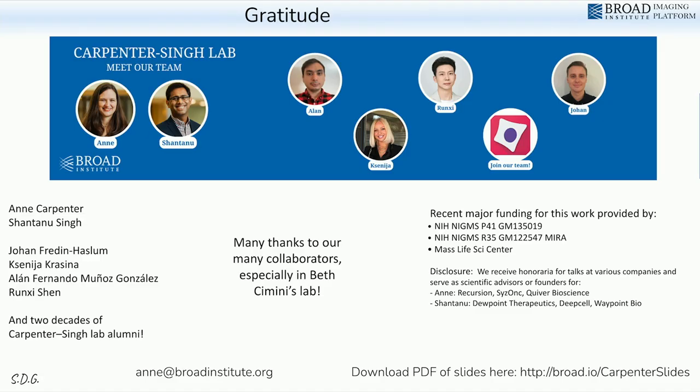Maybe I'm on the side of the audience who are working on more like, we have a biological question and we are trying to apply cell painting, and then we go to present in our department and the cell biologist in the room always raises a hand: okay, you've painted, you get these features, so what? Sometimes I struggle with that answer right off the bat because I can start wobbling around. Well, it's a manifold. We have many features. It's more complex than you think. But how do we make sense? What are the steps to make biologically meaningful intuitions about the feature space that we observe, like in a disease state?